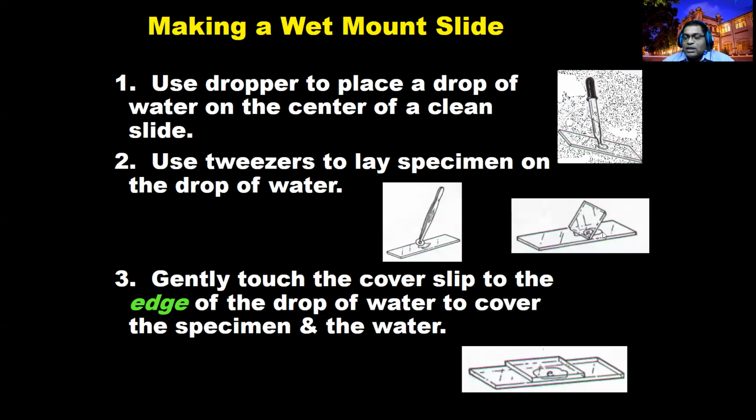Put them on the slide where you put a drop of water, and just immerse them, right? You immerse them and gently touch the cover slip to the edge of the drop of water. Once you have placed the sample, place one edge of the cover slide touching the water.